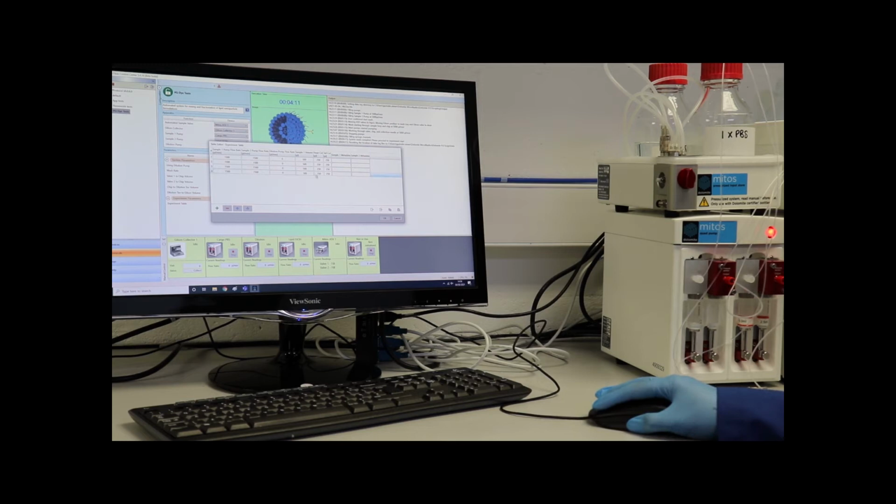I've decided that I want to do a head and tail cut, so a 250 microliter head cut and a 250 microliter tail cut, which means the total fluid packet of 1 ml would have the front 250 microliters and the back 250 microliters removed, so I should collect a 500 microliter sample in my automated collector.